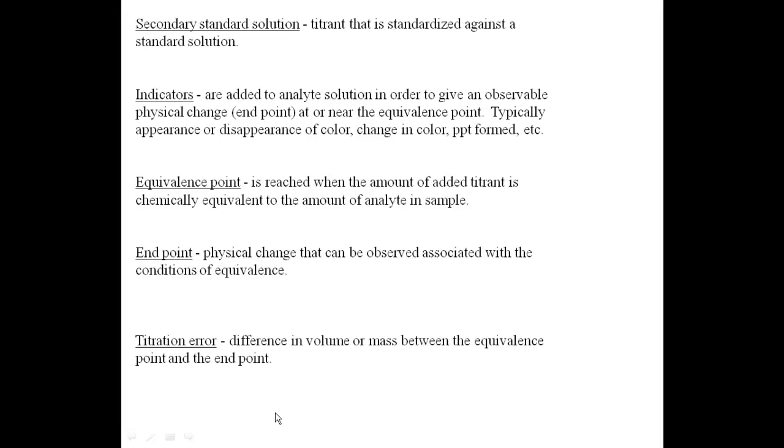Well, if there's an error associated with your experiment, are there ways to get around that error? Yes, there are. One is like we're doing in this experiment. Our acid and base is the same in our standardization process as well as it is in our experimental process. So therefore, any differences are canceled out. Same difference in both experiments.